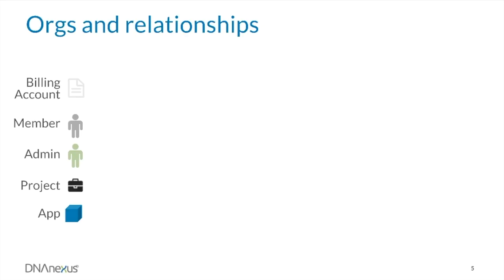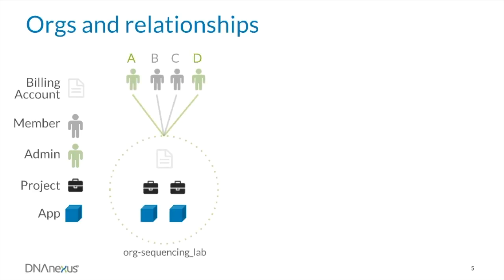In the past few minutes, we've shown simple examples where a given user belongs to only one org. However, users can belong to and even administer a number of orgs. For example, if a user is working with two labs with two different budgets, the user may need to create and work in projects billed to the two respective orgs. In this example, we have our original org, Org Sequencing Lab, and a second org, Org Research Group.